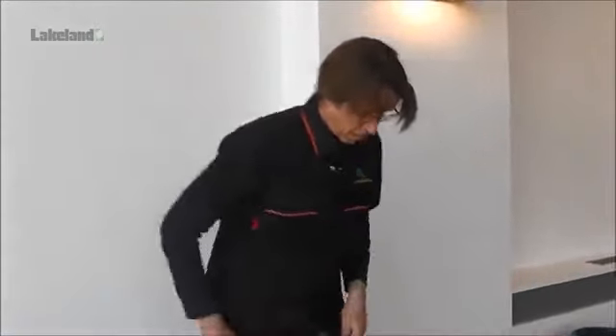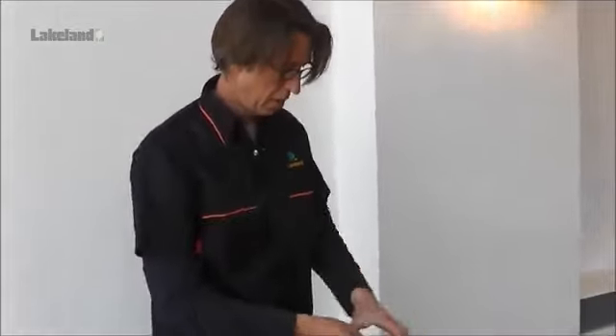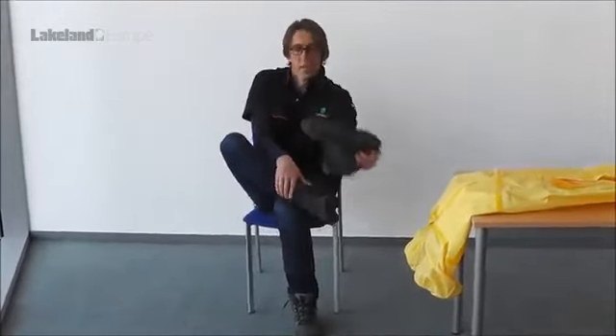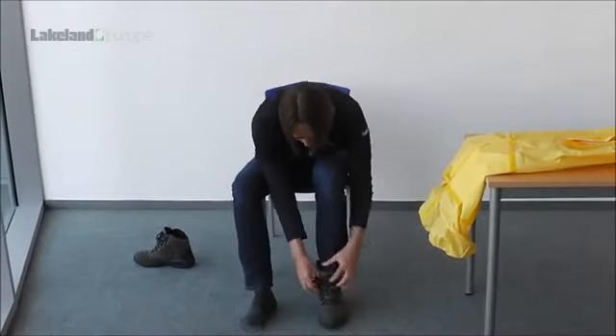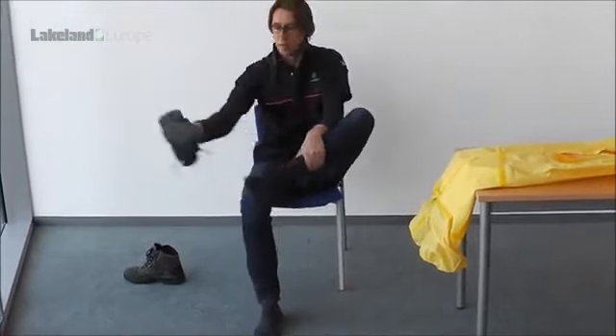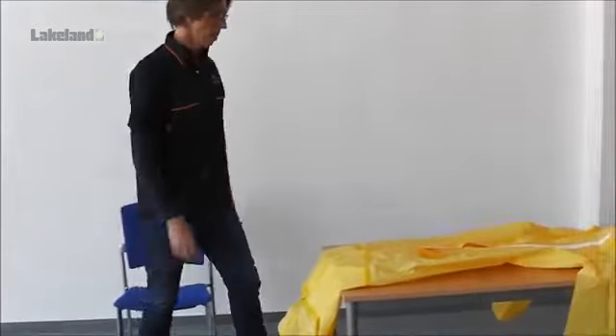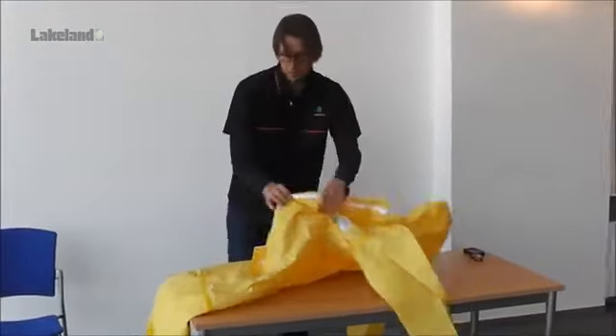At this point, it is a good idea to remove any jewellery, watches, phones or similar items that might damage the garment. It is also vital to remove shoes before donning to avoid unnecessary stress on leg seams.